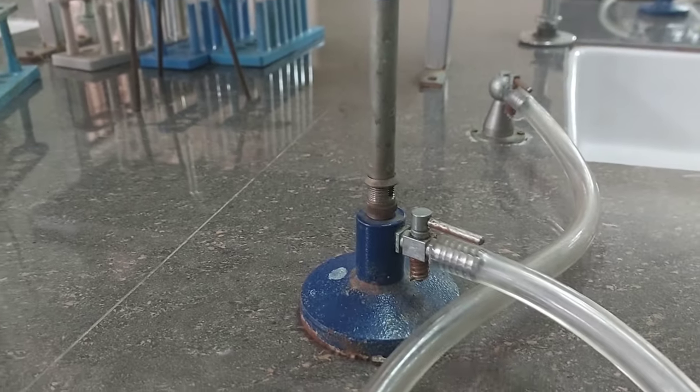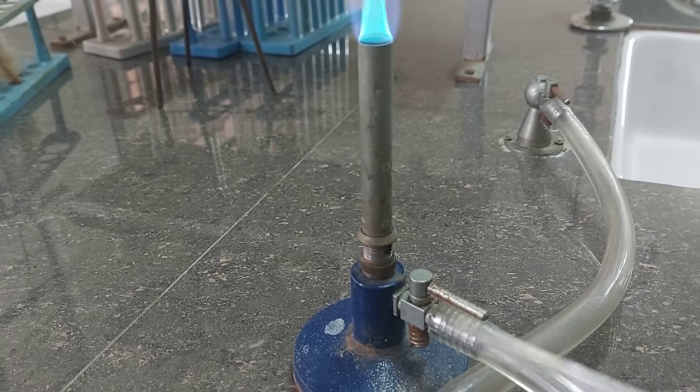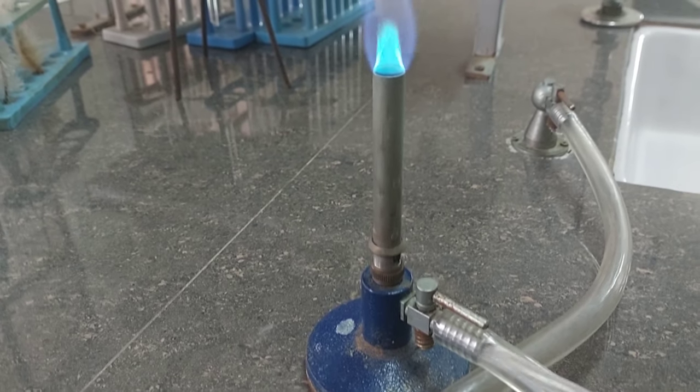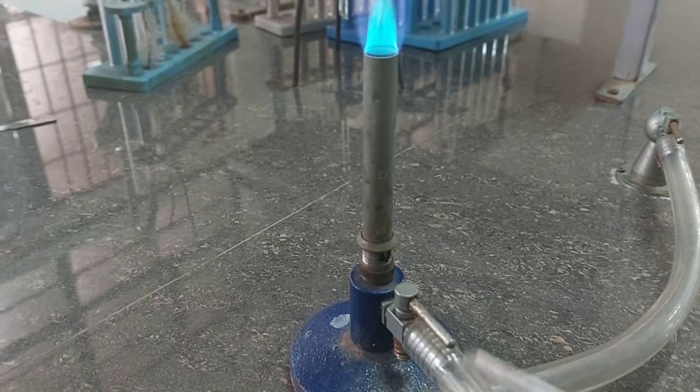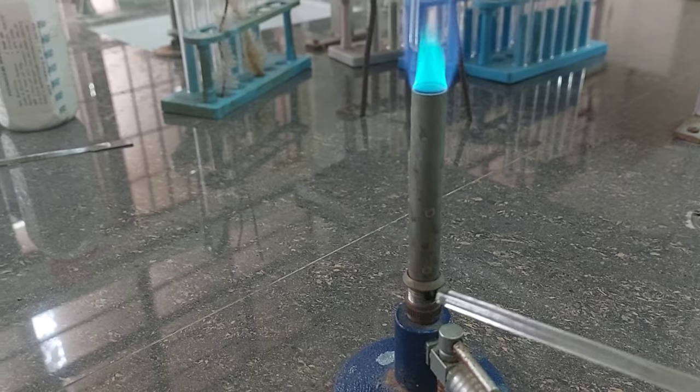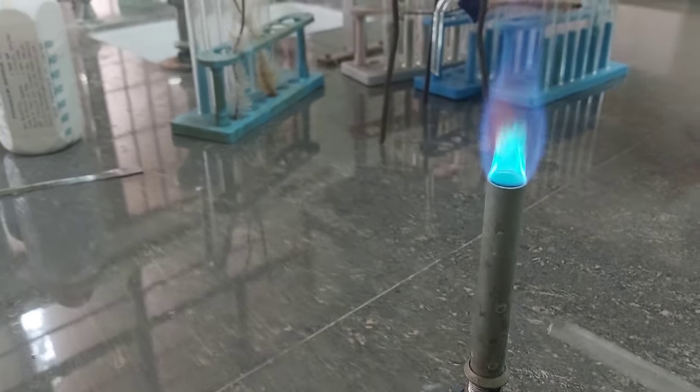This is the Bunsen flame. This is the valve which controls the inflow of the gas which is used as fuel, which is burning, which is mostly methane. This is the hole by which we are going to control the oxygen flow, so air and oxygen are going to undergo combustion.